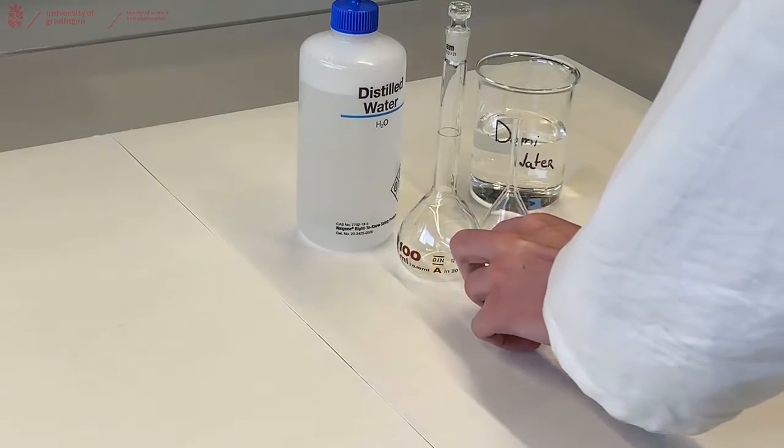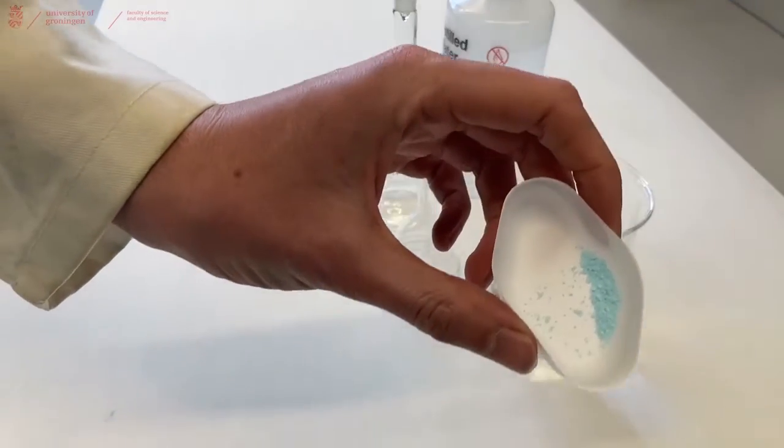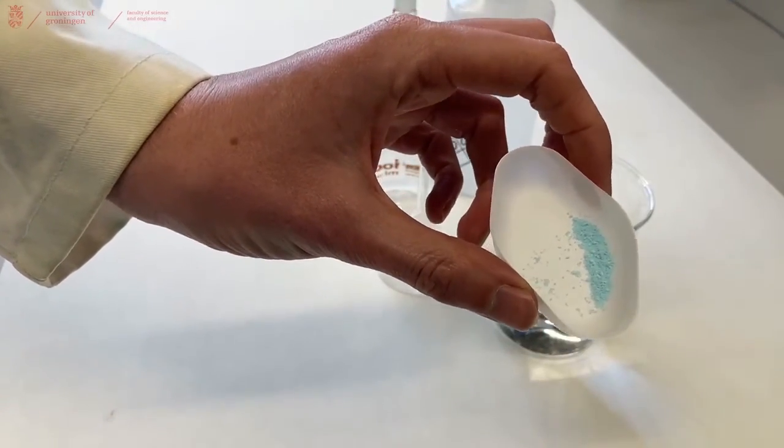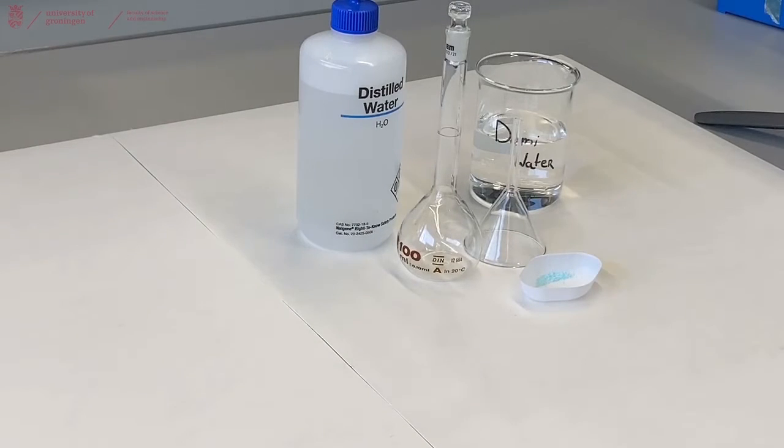So if you have a solid, you can weigh off a known quantity in a weighing boat and make sure that you note down how much this is. Or you can have a liquid where you pipette an exact amount of liquid, or you have a solution of known concentration and then you will dilute it into the new volumetric flask.